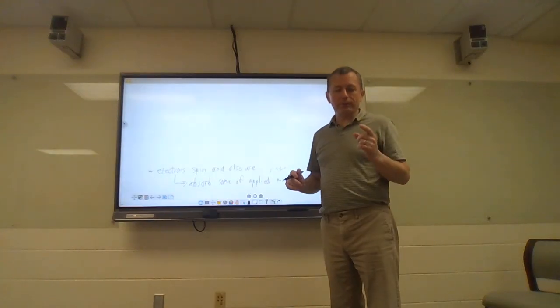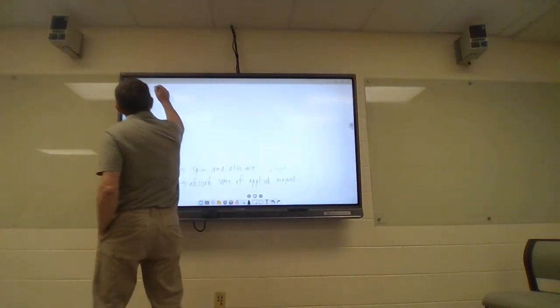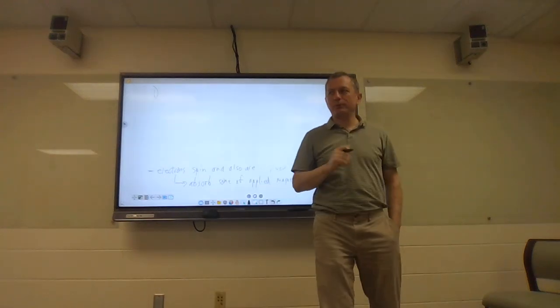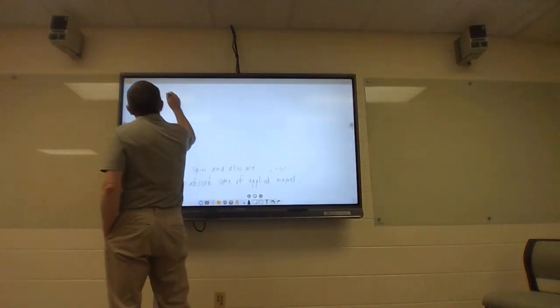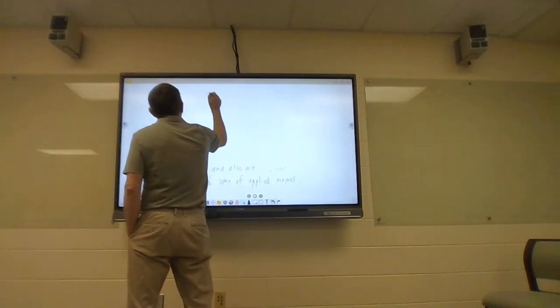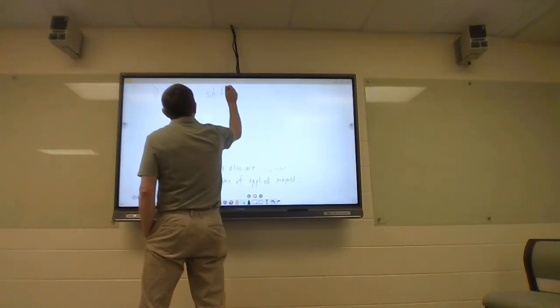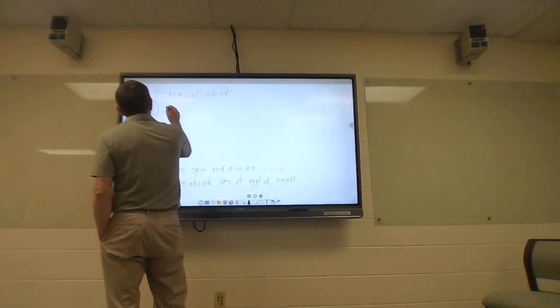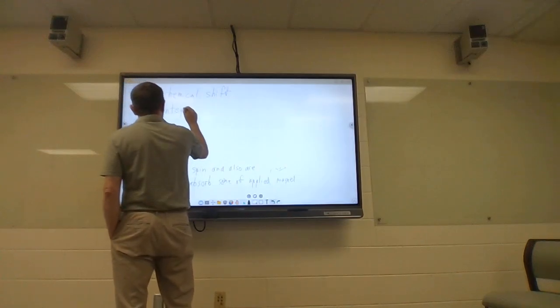So I'm gonna tell you this way. And I want you to approach every NMR spectrum this way. First, chemical shift. Second, integration.